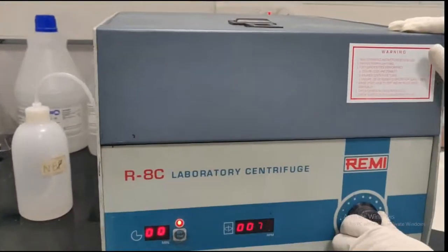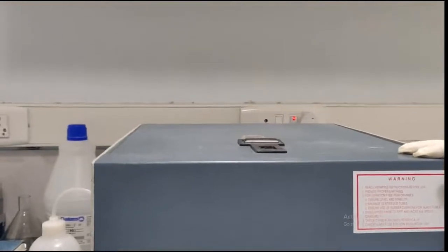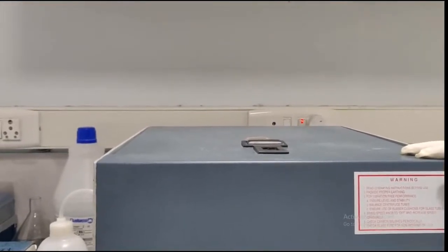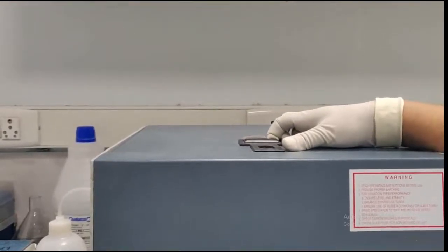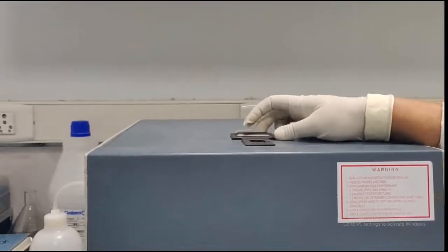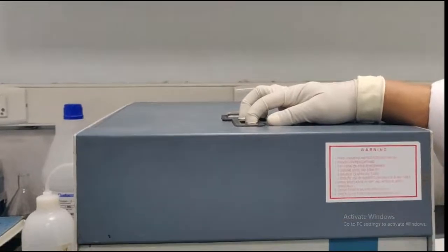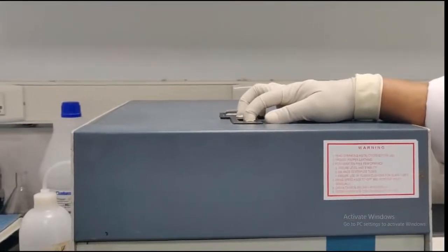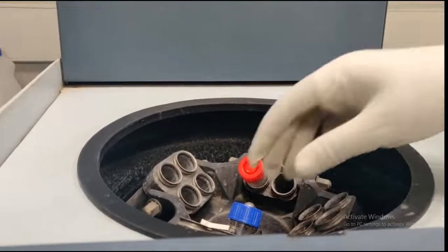So the basic principle in this technique is that the sodium alginate will transform into a gel when it is mixed with calcium ions. So in the presence of calcium ions, it will turn itself into a gel. So we have to ensure that this sodium alginate mixes properly with the sample so as to ensure that our sample is present in that gel. Now the centrifugation is over. We are taking out the tubes.